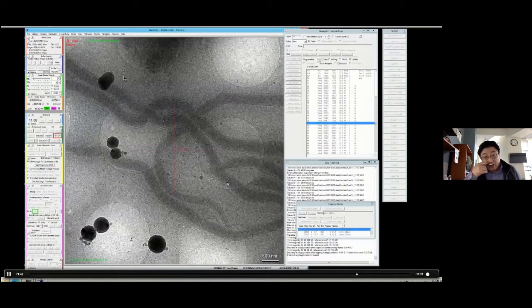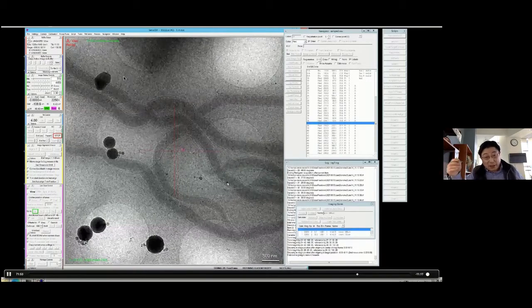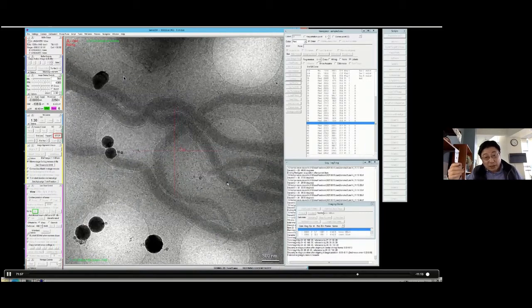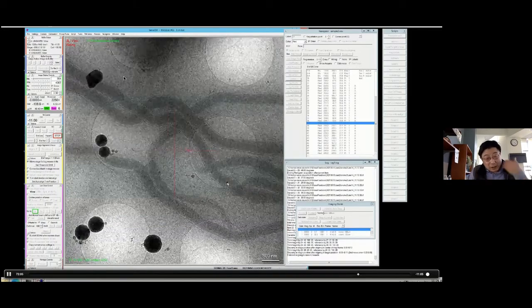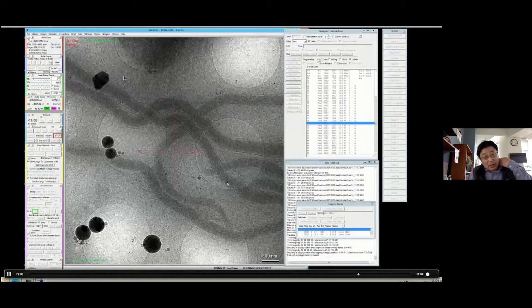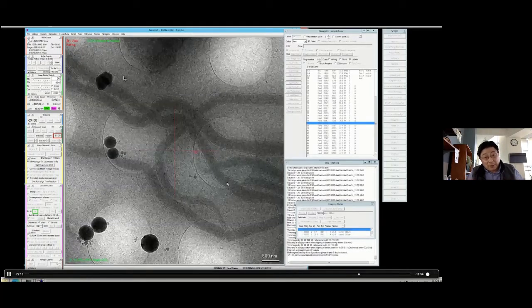So eventually you want to find a balance: not too many, like decorated with gold, and not just one or two, which seems not optimal for data analysis. In all, you need to take advantage of getting feedback very quickly now, and use that feedback to help you select better targets.